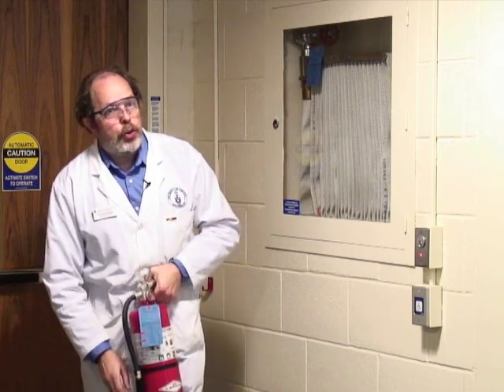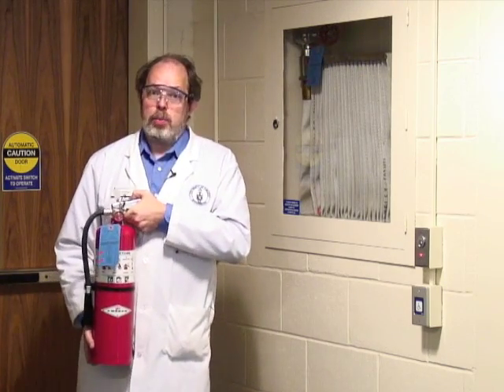If one extinguisher is not enough, leave it to the professionals and get out. If you don't feel comfortable using one, just get out. Leave by the fire exits and pull the fire alarm. There will always be a fire alarm pull station next to one of the exits.